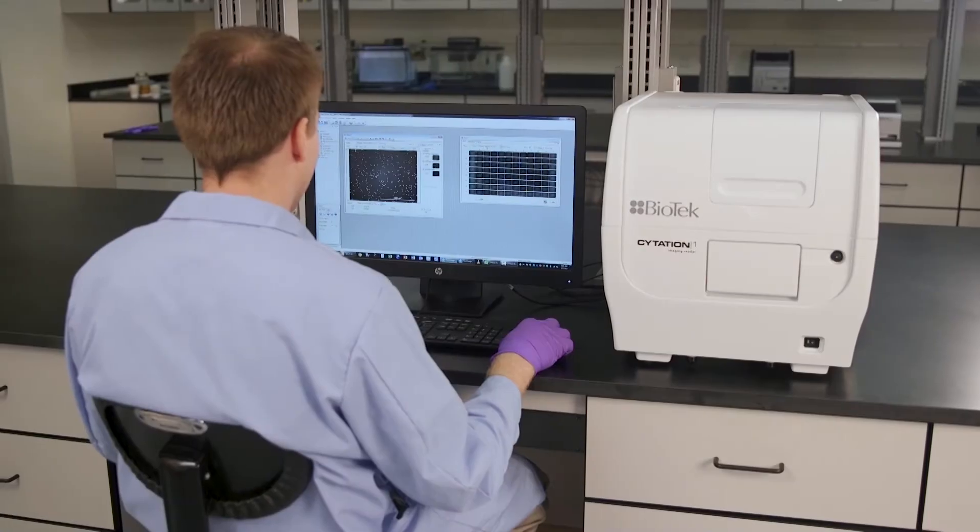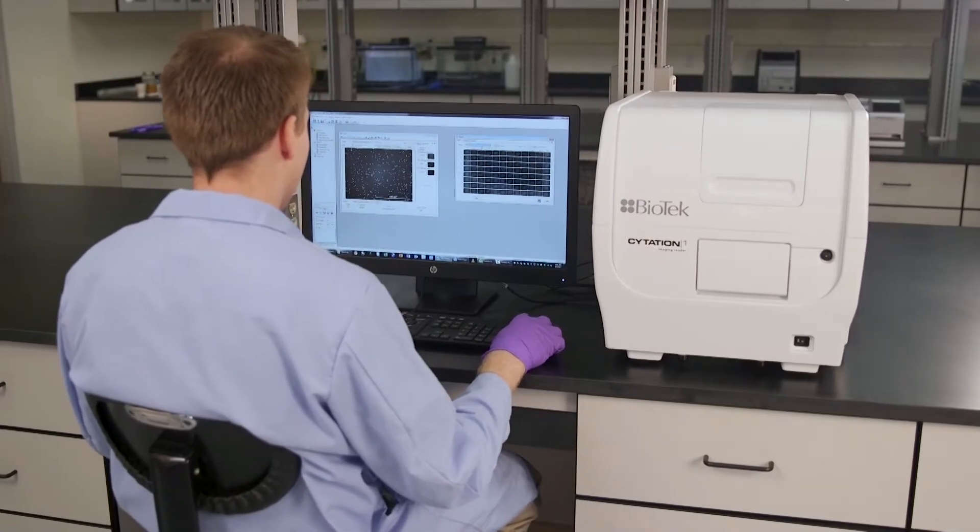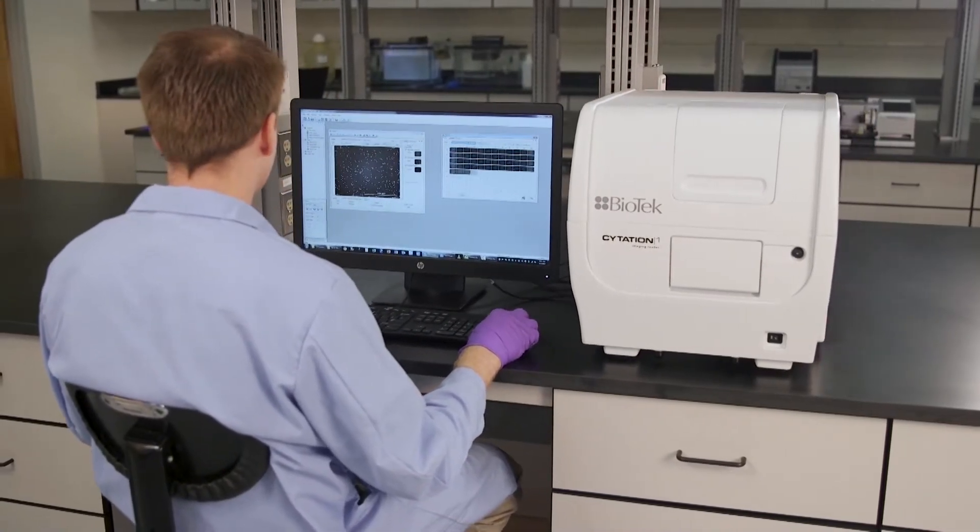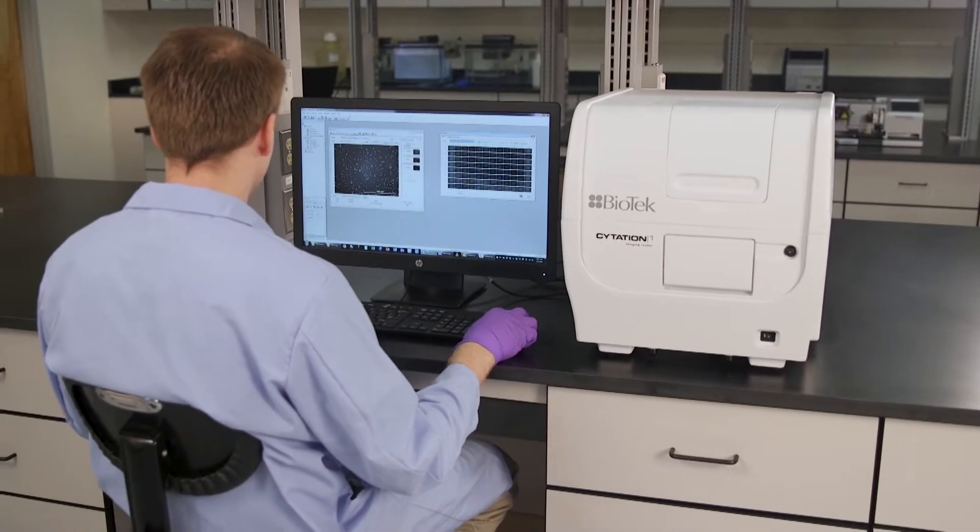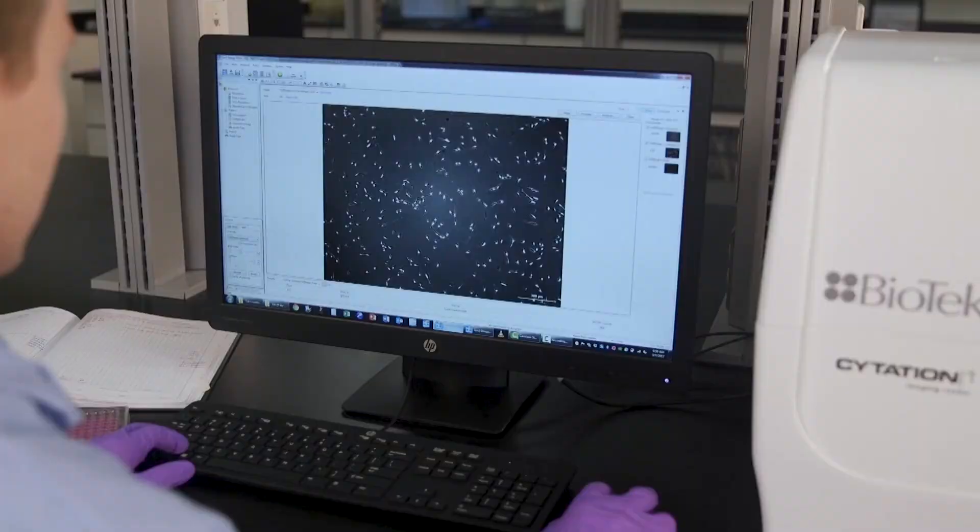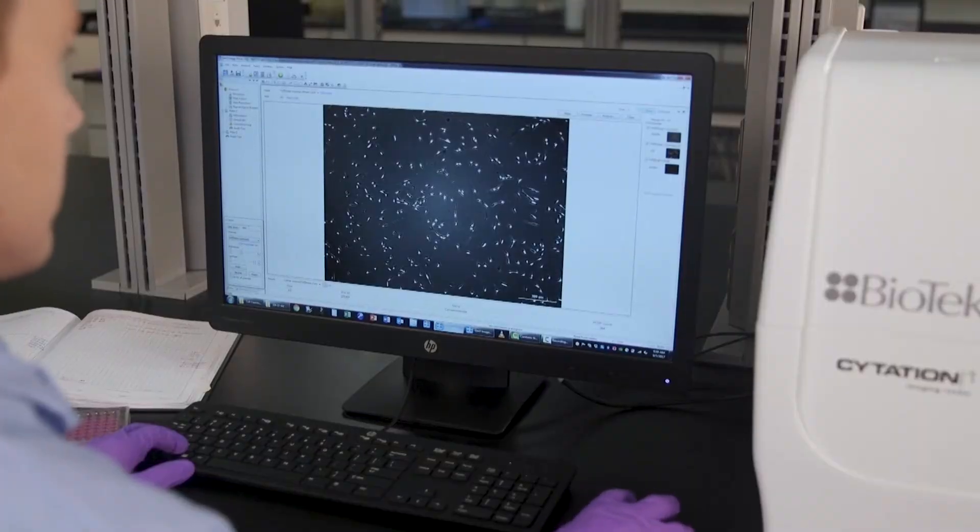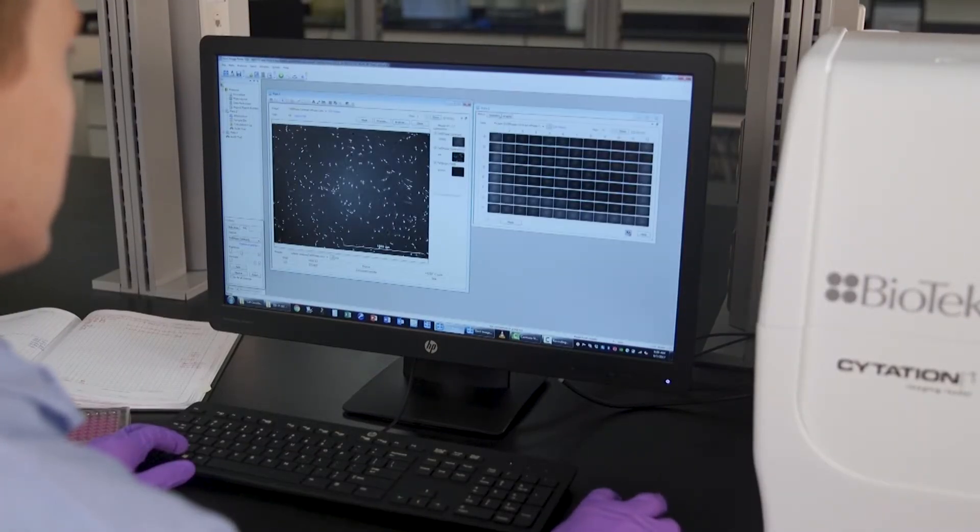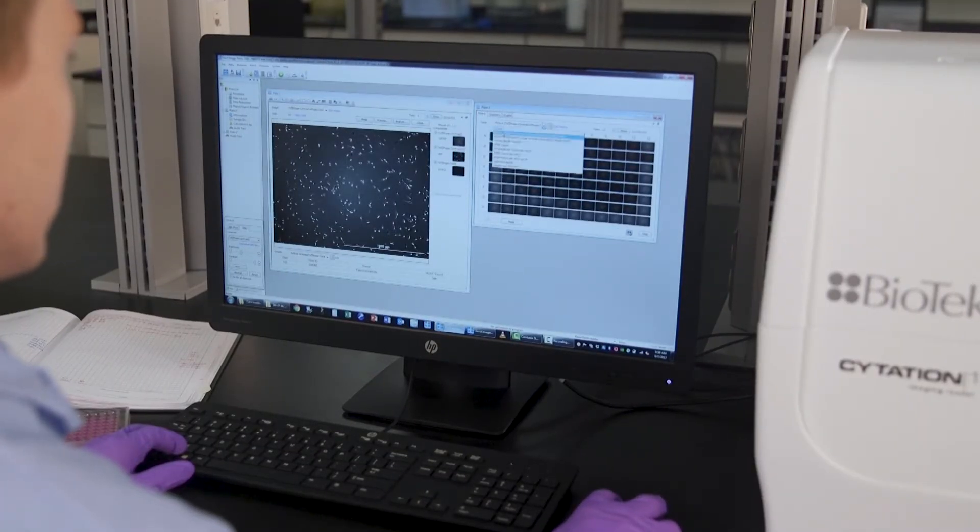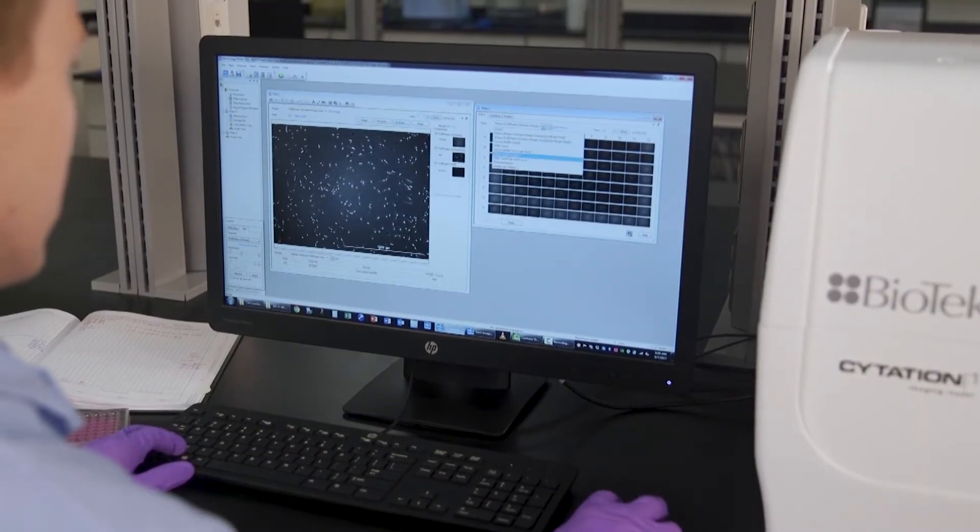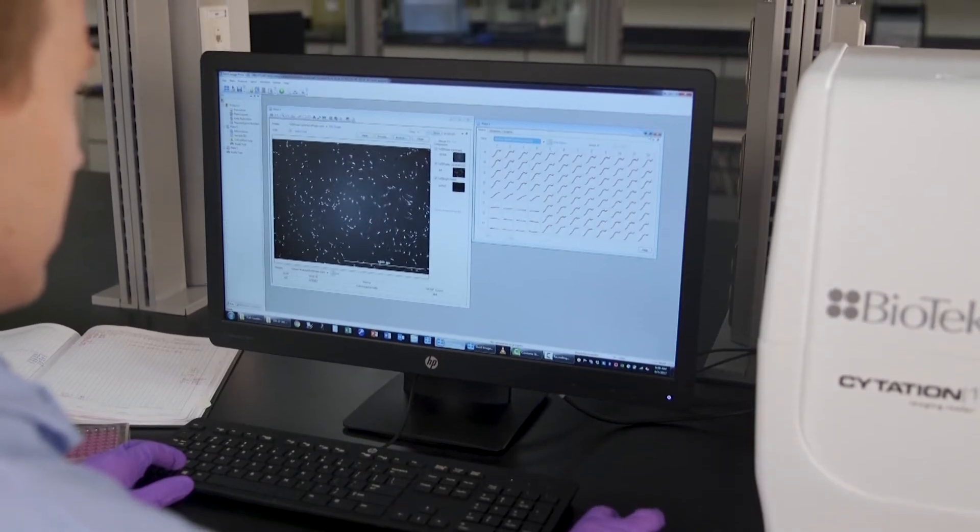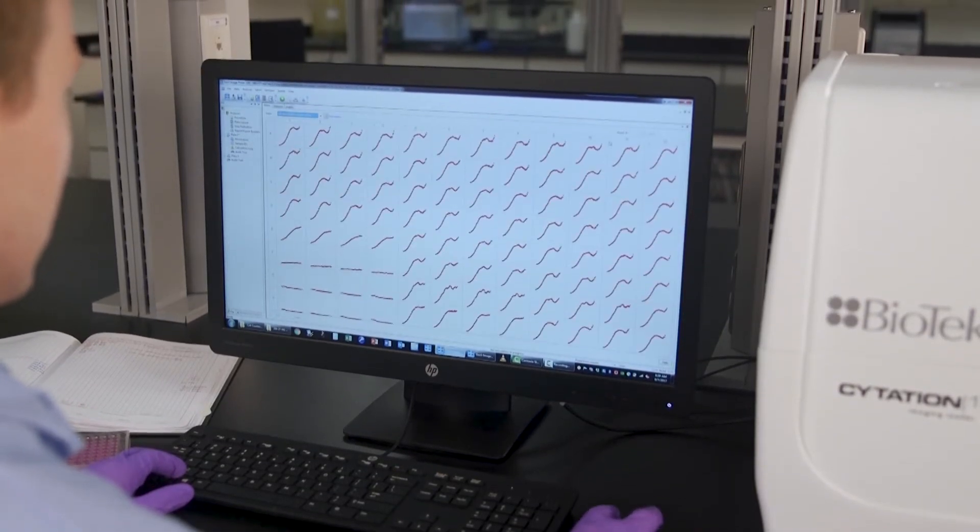Cell counting is widely used as a measurement in tissue culture to assess cell density for cell-based assays, as a readout in proliferation, viability, and toxicity assays, and to normalize cell-based assay results for differences in cell density.